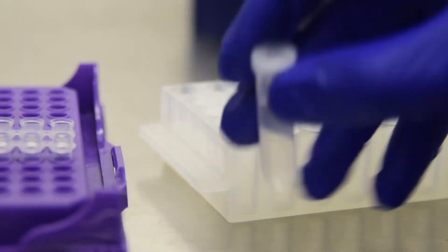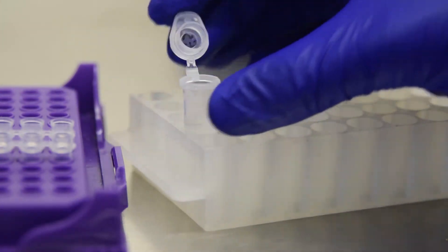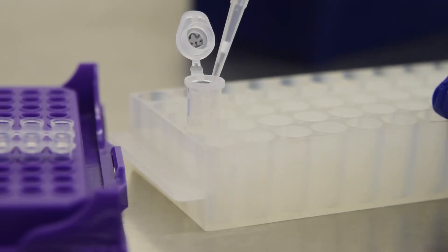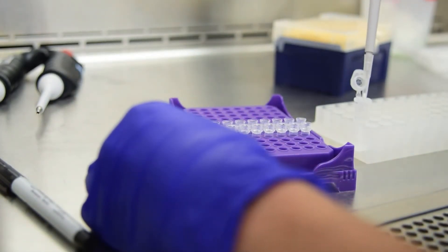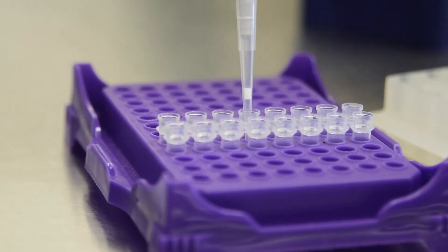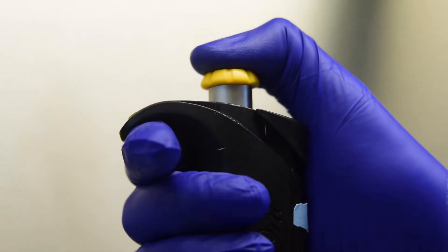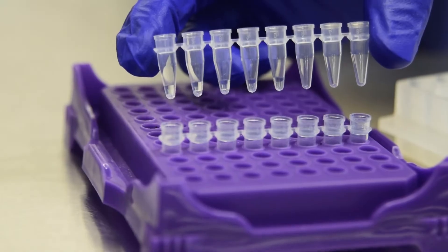Open the ES tube carefully without touching any internal surfaces. Fill the strip with 20 microliters of ES per well, counting as you go. You can check your progress by lifting up the tubes. Eject your tip after finishing.